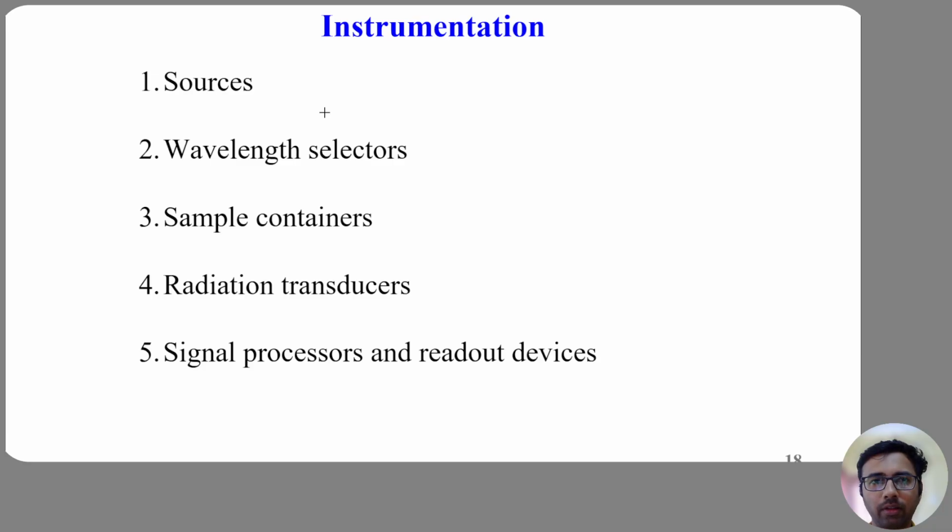Regardless of manufacturer, price or application, every spectrophotometer contains 5 fundamental components. Let us examine them carefully. First is a stable light source. This generates the incident radiation that interacts with the sample. Without a stable source, all measurements become meaningless. So, it is very important to have a stable light source.